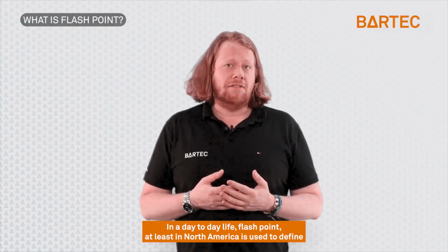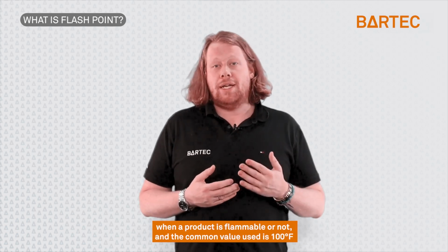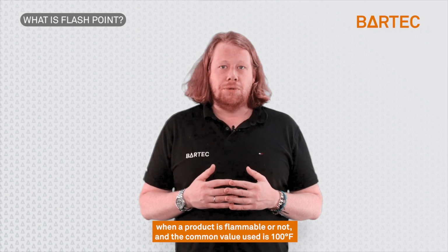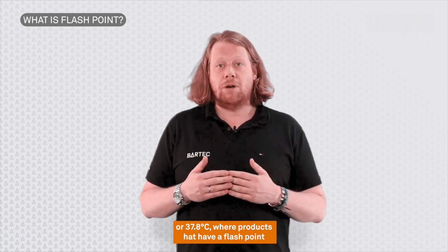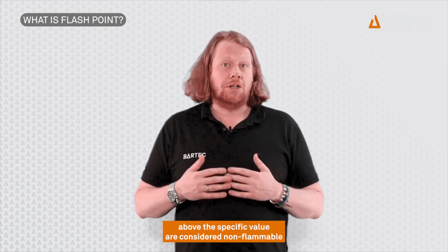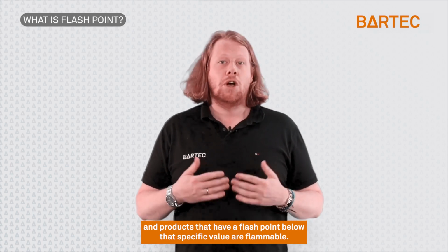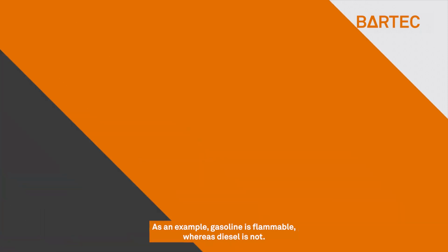In day-to-day life, flashpoint, at least in North America, is used to define when a product is flammable or not. The common value used is 100 degrees F or 37.8 degrees Celsius, where products that have a flashpoint above this specific value are considered non-flammable, and products that have a flashpoint below that specific value are flammable. As an example, gasoline is flammable, whereas diesel is not.